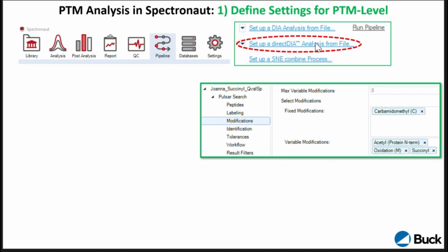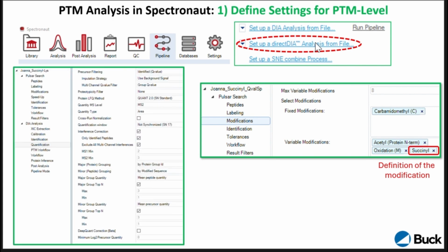We actually here choose succinylation, as I mentioned to you. So you basically just add that modification into your search engine, into Spectronaut, and then you have certain parameters you can set. I think we can share the slides, and also I think this is recorded, so you can look back at the specific settings.